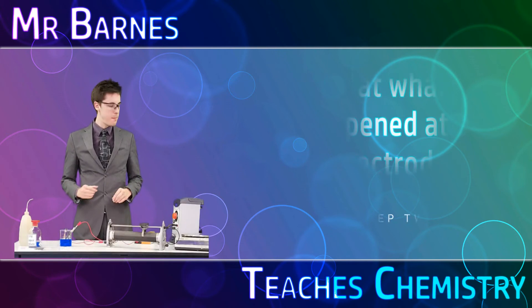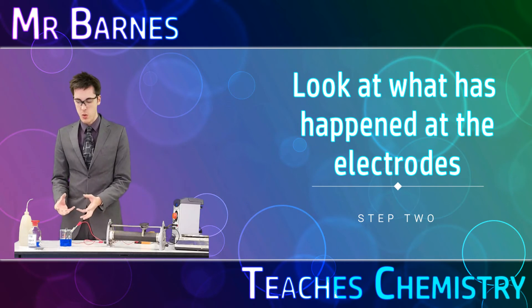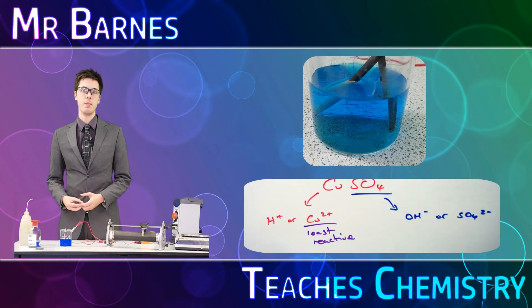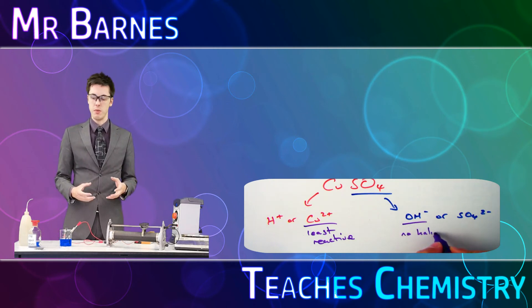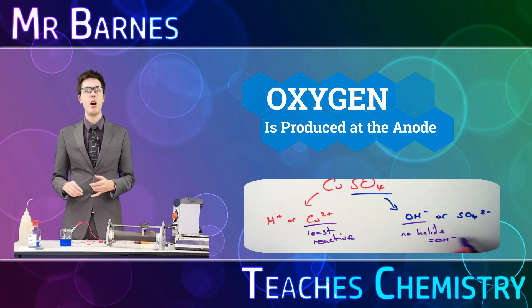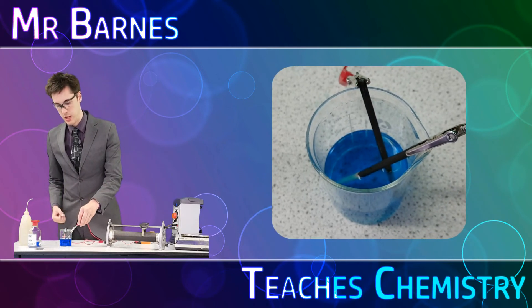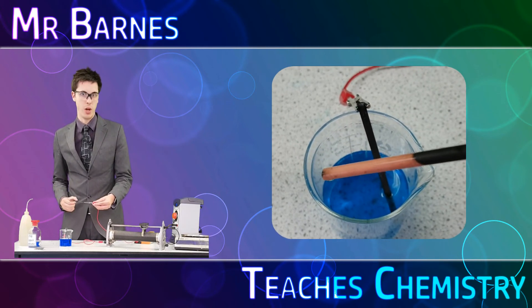After leaving it going for a few minutes, one of the things that is quite obvious to see is there is fizzing going on — some bubbles being produced at one of the electrodes. Those bubbles are oxygen. If you've got a sulfate or something that isn't a halide, oxygen is always produced at the anode. The cathode is where the metal is deposited, and you can see it has changed colour and got that coating of copper.